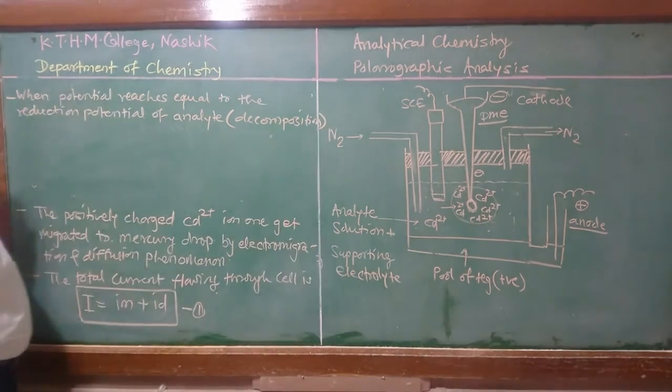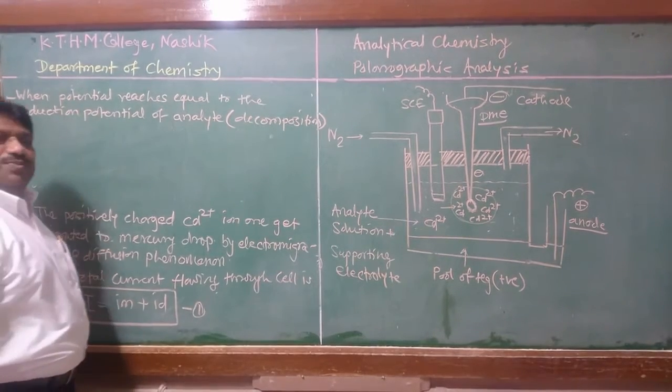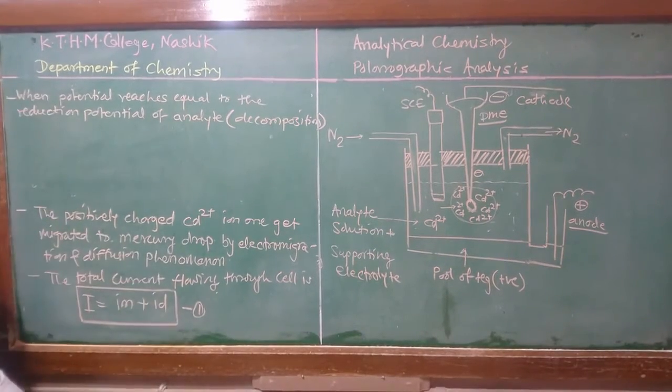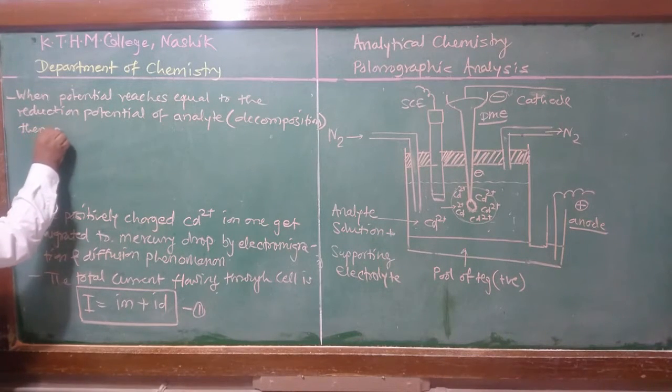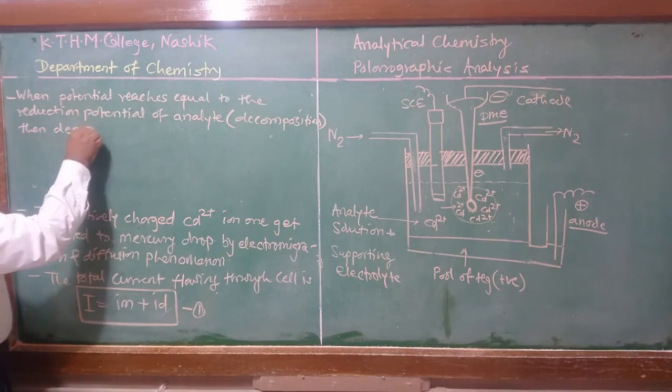The applied potential, when it reaches the reduction potential of the analyte, is called the decomposition potential. Then the deposition of the analyte takes place.